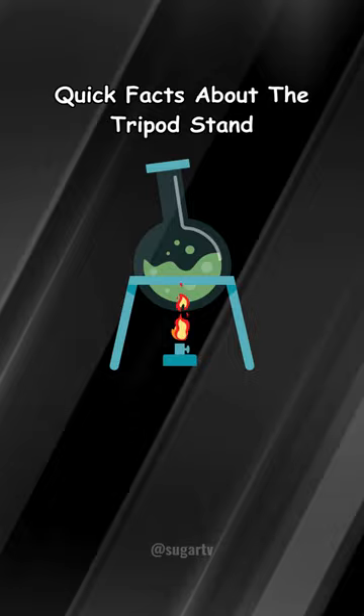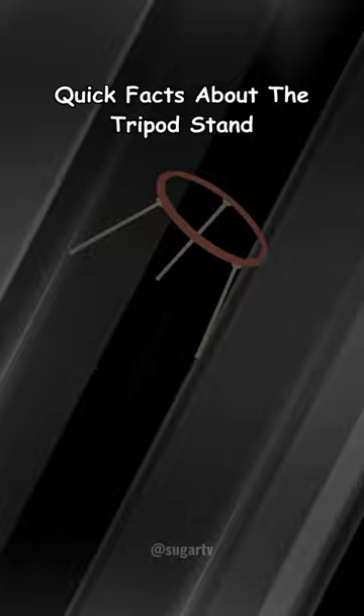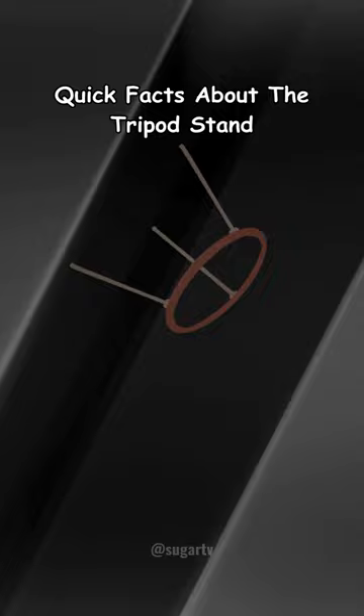The adjustable legs accommodate different vessel sizes and shapes, ensuring uniform heating by allowing the flame to distribute heat evenly across the base. Crucial for conducting experiments that involve direct heat applications, the tripod stand is a versatile tool in laboratories, facilitating safe and controlled heating processes.